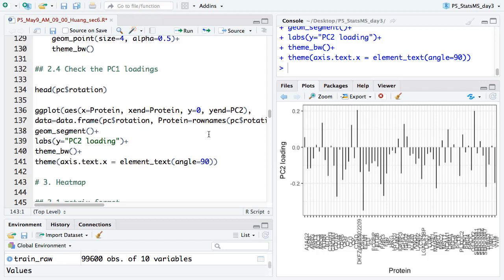In ggplot2, you first tell it what your dataset is — here it's some data frame with different columns for attributes. The dataset has all the rotations — 66 columns for 66 PCA components — plus one additional column for the protein name. For the loading plot, we tell ggplot that x is protein and y is the PC value. This is a segment plot, so we need to specify the start and end points for both x and y.